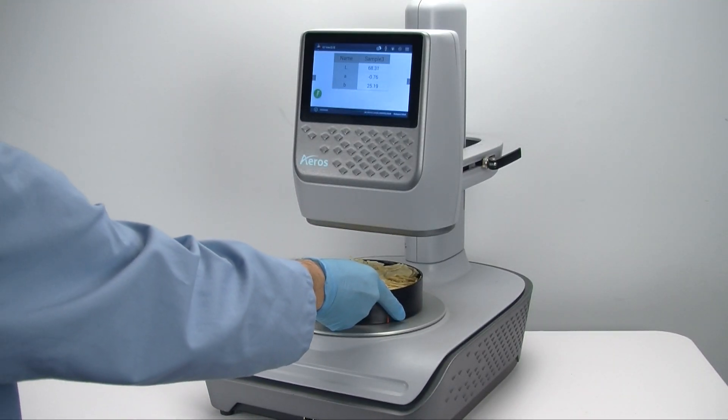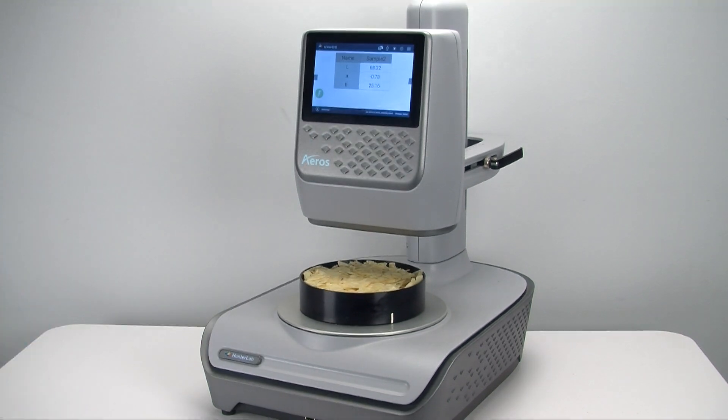Place the sample pan onto the Eros. Press Go on the touch screen to initiate the measurement process and the Eros goes to work. It automatically determines the distance between its sensor and the sample surface and adjusts itself to the correct distance.